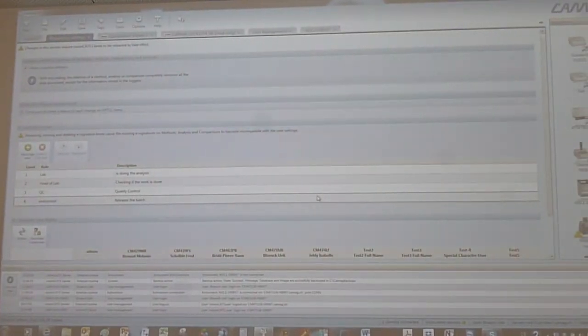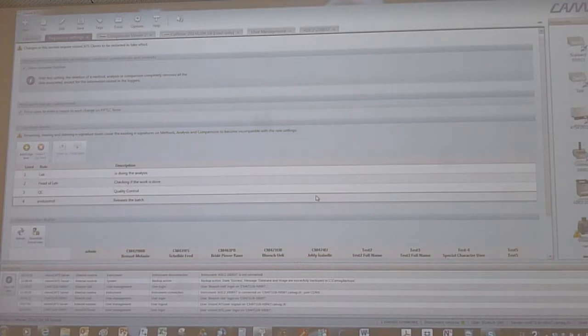So on the top, this setting is about deleting of analysis and methods. So the good thing in Vision Cats is that if you had WinCATS, if you activated 21 CFR, it was a full package. You could not delete, it was full safety. Here now, you can adjust a little bit more. But you can say, I would like to have the log files and everything, this is nice, but we can delete, that's no problem for us.